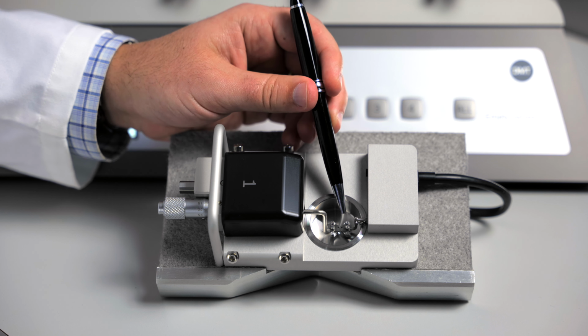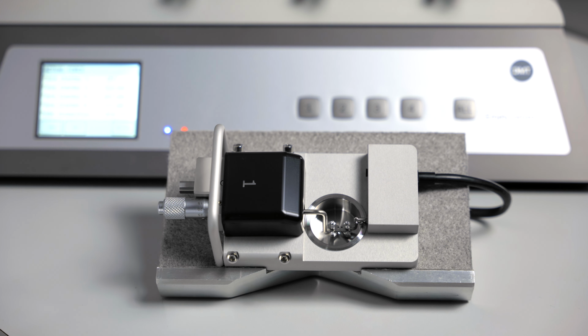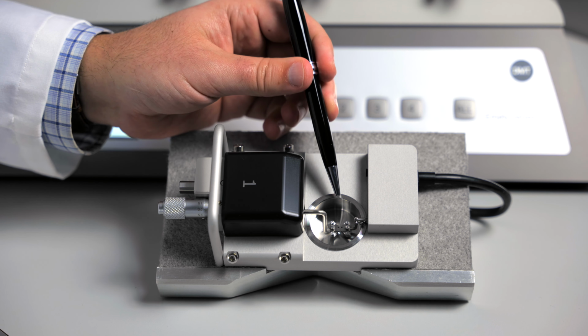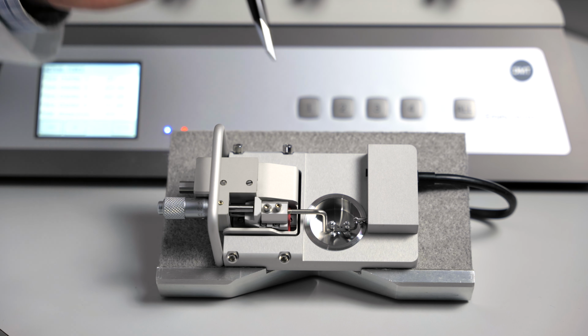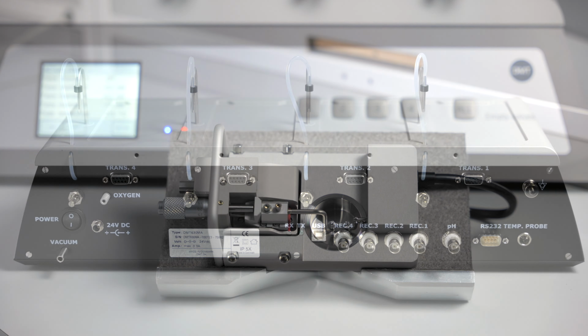You do need to be careful anytime you handle anything connected to the force transducer. You have 4 positioner screws that will help you get the mounts perfectly aligned. This will allow you to record 100% of the tissue responses. Each chamber also has a built-in motor, which is used during the automated normalization feature.